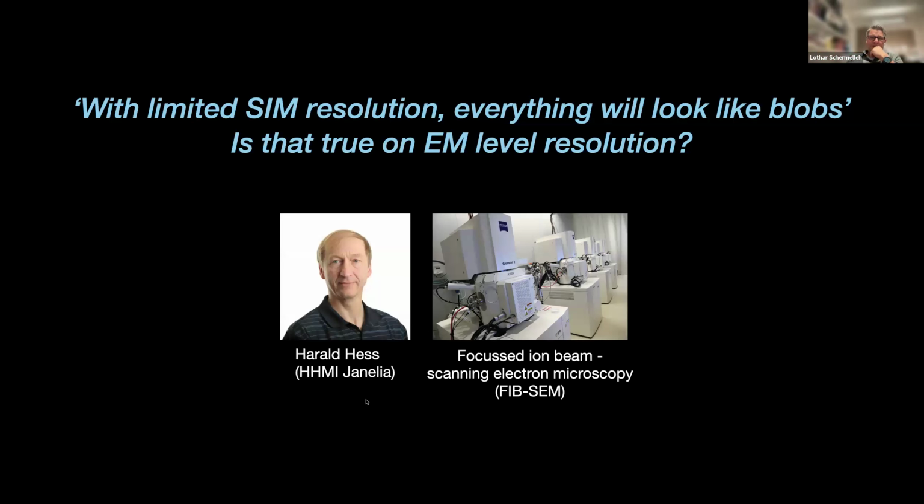And during that time, Harald Hess at Janelia developed his pipeline of very dedicated focused ion beam scanning electron microscopes, FIB-SEM, that operate at extreme high resolution. And importantly, Harald and his team use high pressure freezing and freeze substitution. So basically a technology that avoids chemical fixation and is recognized as the most structure-preserving method.